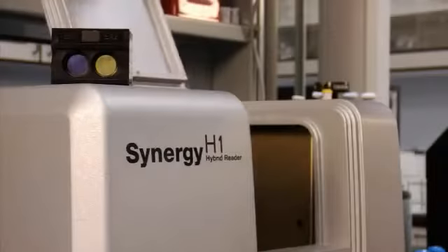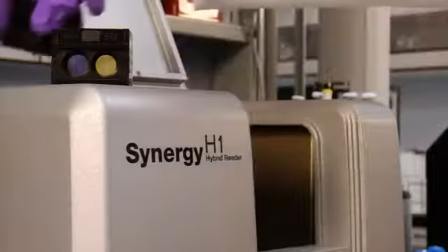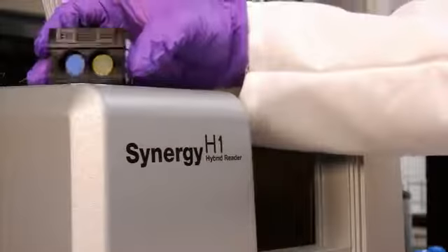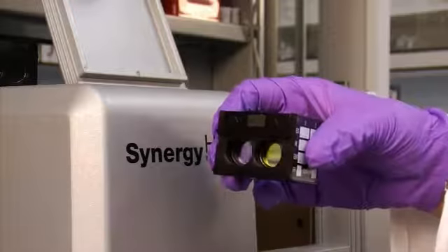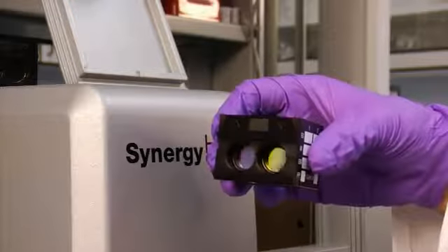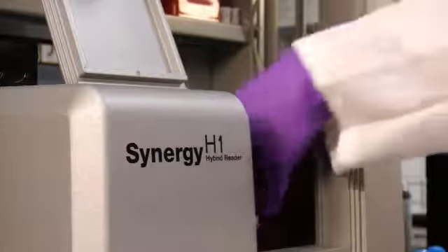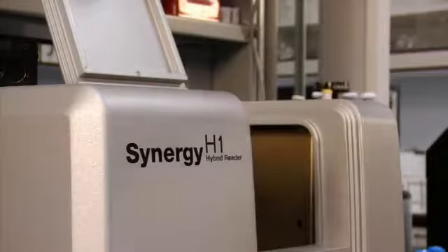The filter optics come with easy to use filter cubes. Each filter cube contains all the required filters and mirrors to detect specific fluorophores. The cubes are positioned using magnets and can be swapped in a matter of seconds to easily switch from one detection mode to the next.